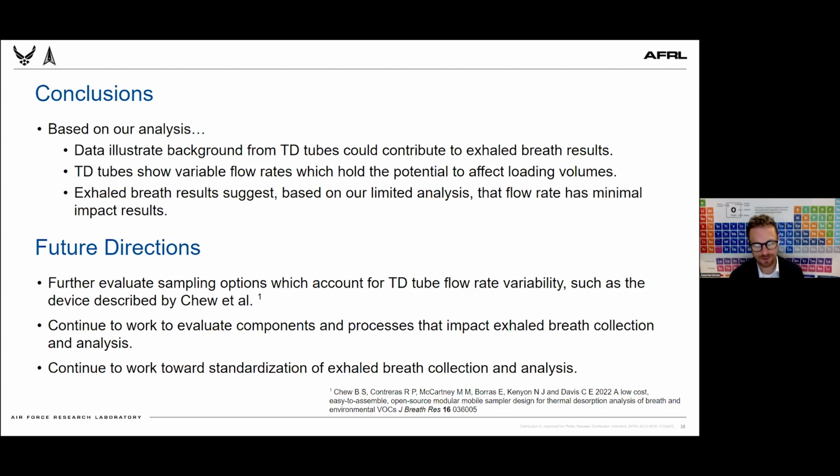We also, within this analysis, used standard bags as well. So we have standard data as well, and those did not show any difference based on flow rate either. So we're not really sure what is going on there, but we have some ideas, and we're going to try to evaluate those going forward.